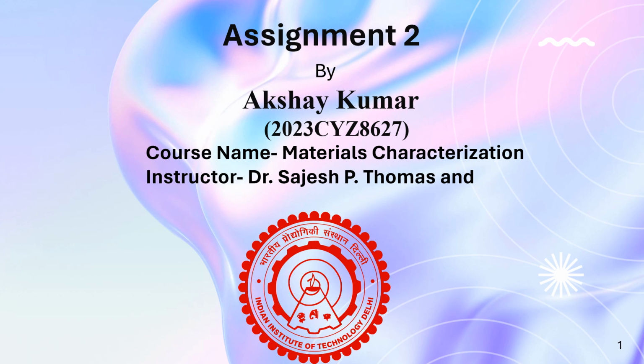Today I am going to present our class presentation as part of assignment 2, where I am going to discuss the solution of the crystallographic point group and the dataset solution of the zip file using OLEX and Vesta.